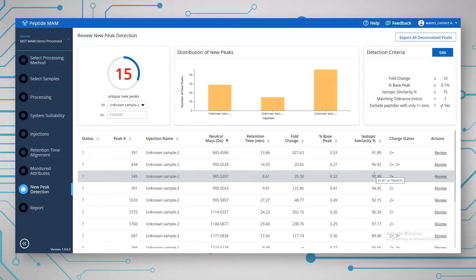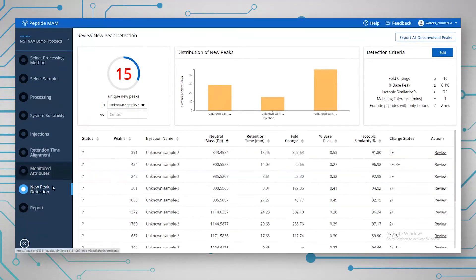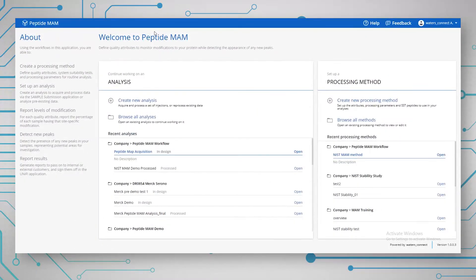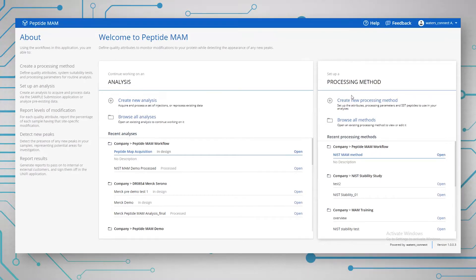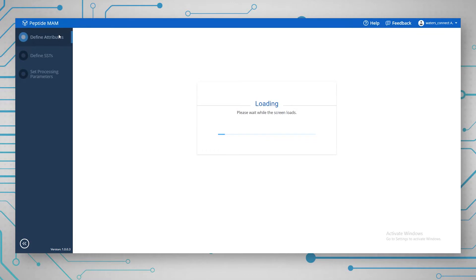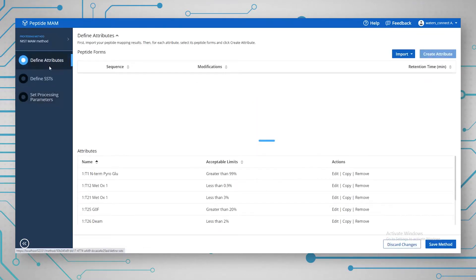Now that I've shown you those two features of the workflow, I want to start from the beginning and take you through how you actually set up the workflow. This is the Welcome to the Peptide MAM page, where you can create an analysis and also create a processing method. The first thing we're going to look at is the processing method. I've already created a method for the NIST Peptide MAM — opening it shows that there are three steps to creating a method. The first step is to define the attributes, the peptides, and the modifications that we want to monitor.